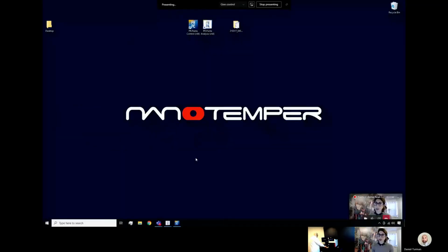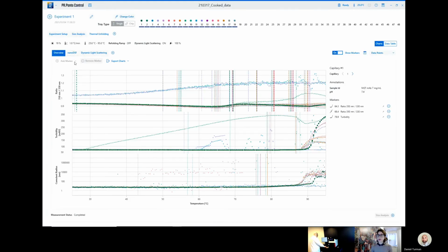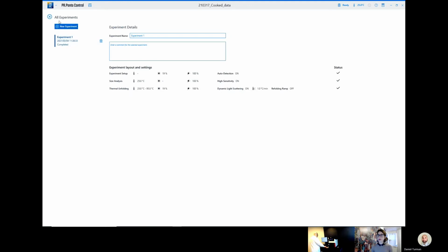So Dan, are there any other sample prep considerations that we need to keep in mind, or is it really just wiping down that mirrored surface? In terms of being at the instrument, that's it. But there are things that need to occur downstream, or upstream, that you'll need to think about.